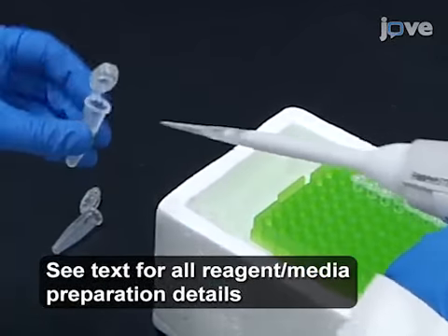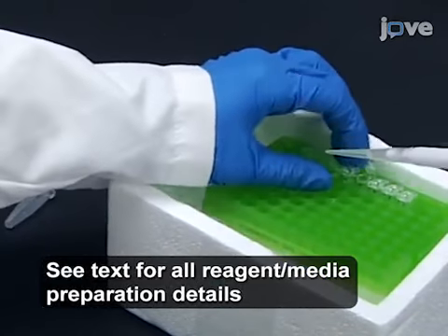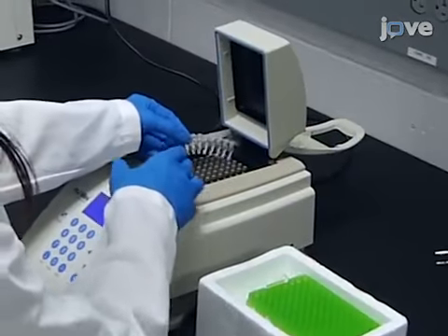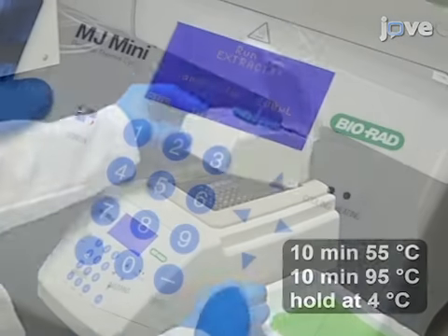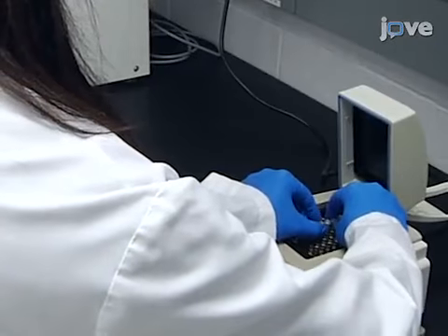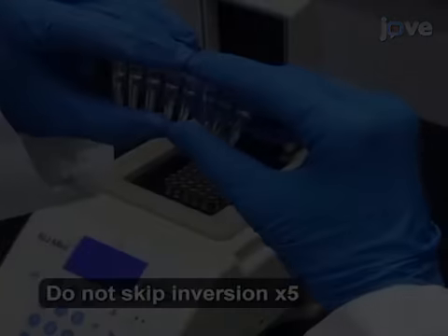Begin by adding 200 microliters of DNA extraction solution to each PCR tube containing a specimen. Place the tube strip into a PCR thermal cycler and then start the DNA extraction. When the extraction is finished, remove the tube strip from the thermal cycler and invert the tube strip.